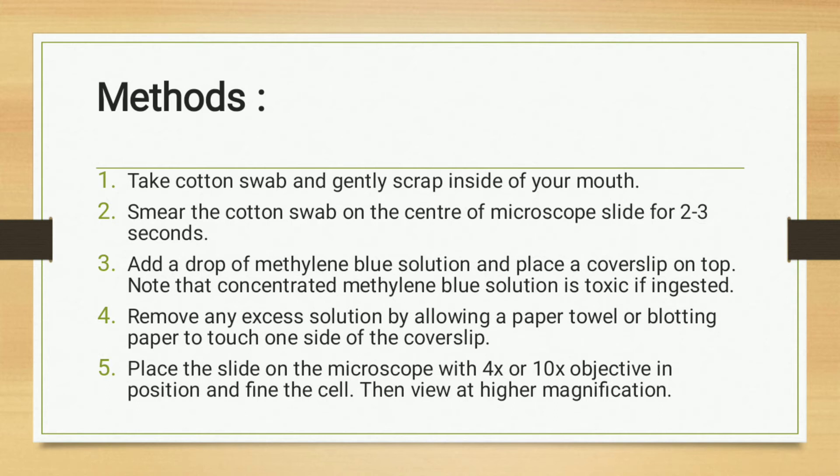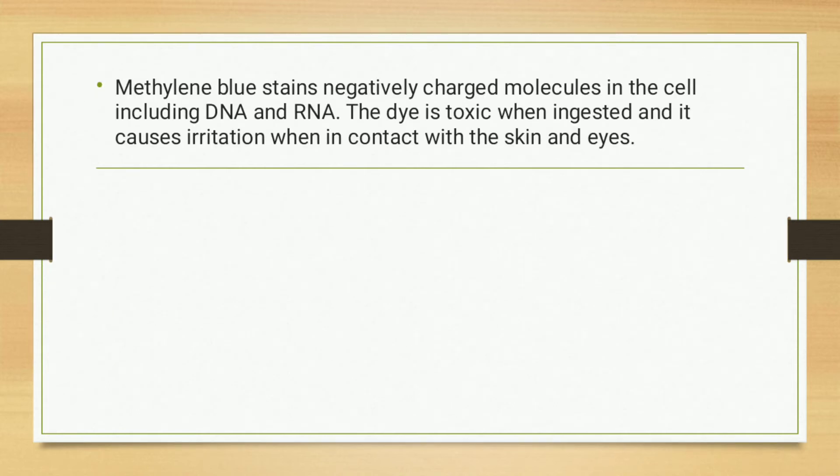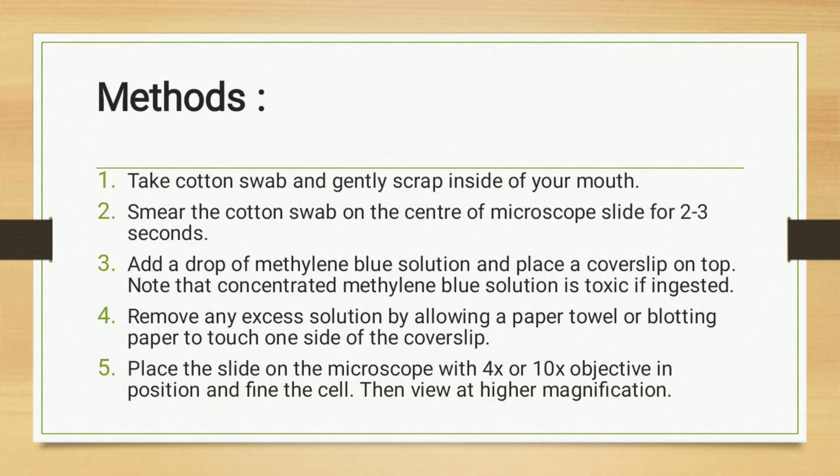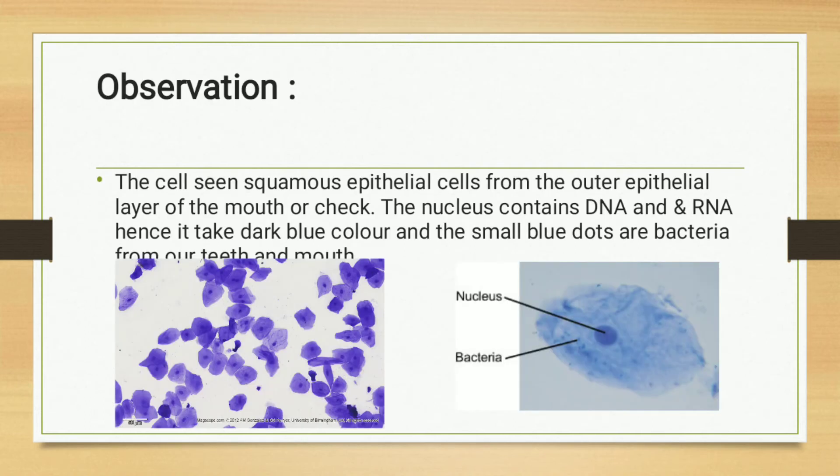Then view it at higher magnification power. Methylene blue stains negatively charged molecules in the cell including DNA and RNA. The dye is toxic when ingested and causes irritation when in contact with skin and eye. This is all about the procedure how to collect the human buccal epithelial cell.